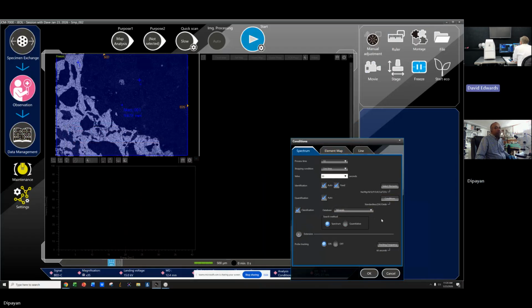And so it'll do this for you. It'll classify all of your spectra. It'll name them to your classifications. Well, then the danger of doing that is I have to play with the 0.8 or 0.9 or whatever threshold I want to choose, because my fear is if I do that, it might question mark some of the minerals if they don't fall exactly in the ideal composition. Correct.